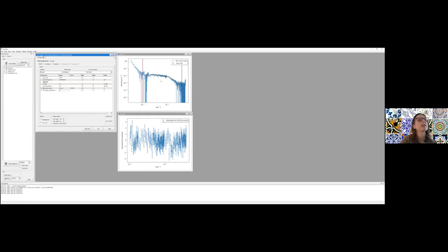And you see your data there plotted? If I click the show plot, I get, I mean, I don't get the upper one, but it looks a bit strange. I don't have the black lines. It's entirely orange. It's no blue. Okay. So what that means is that your data is not loaded.